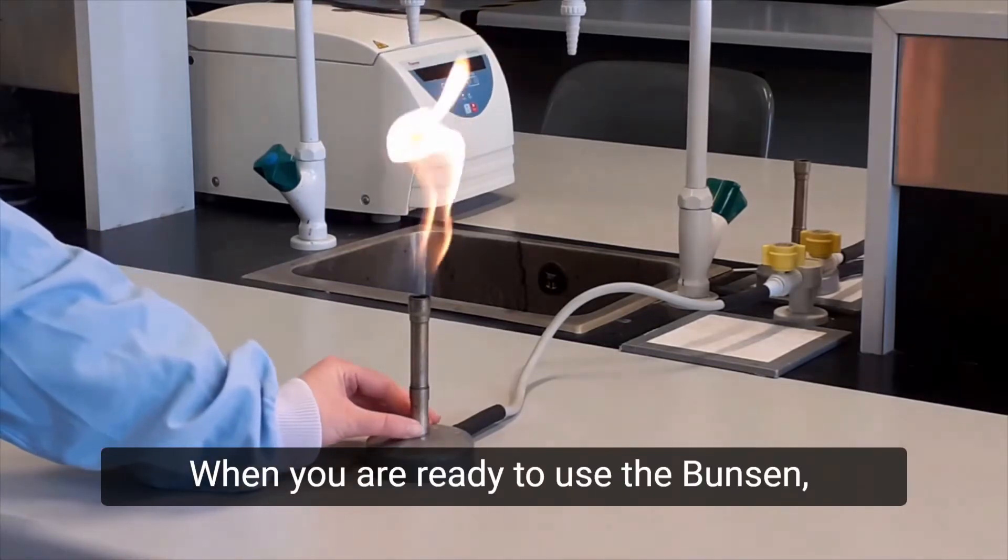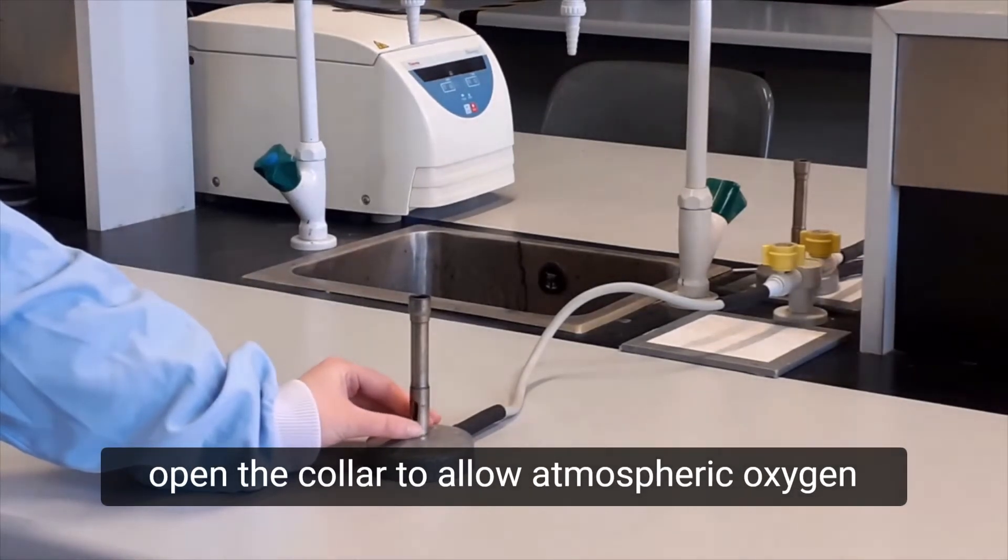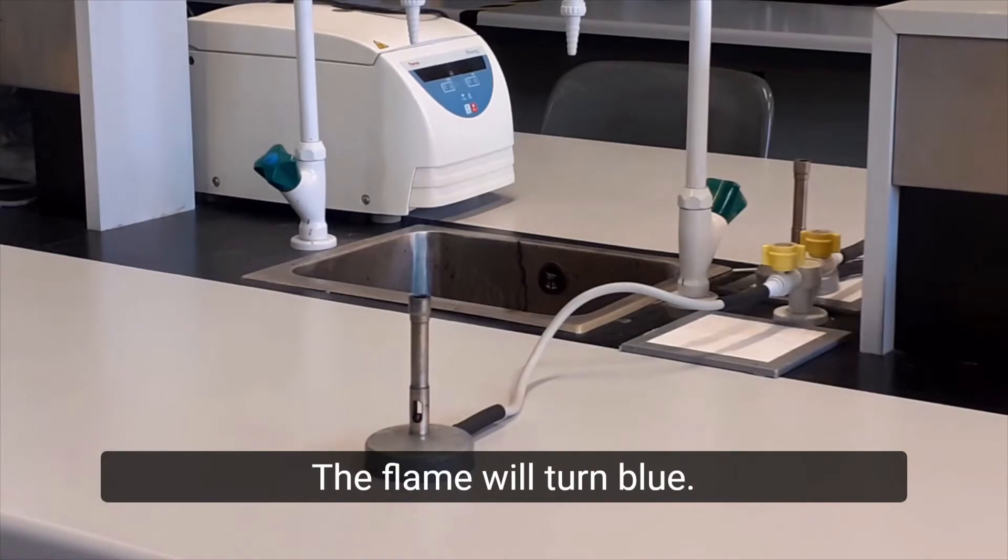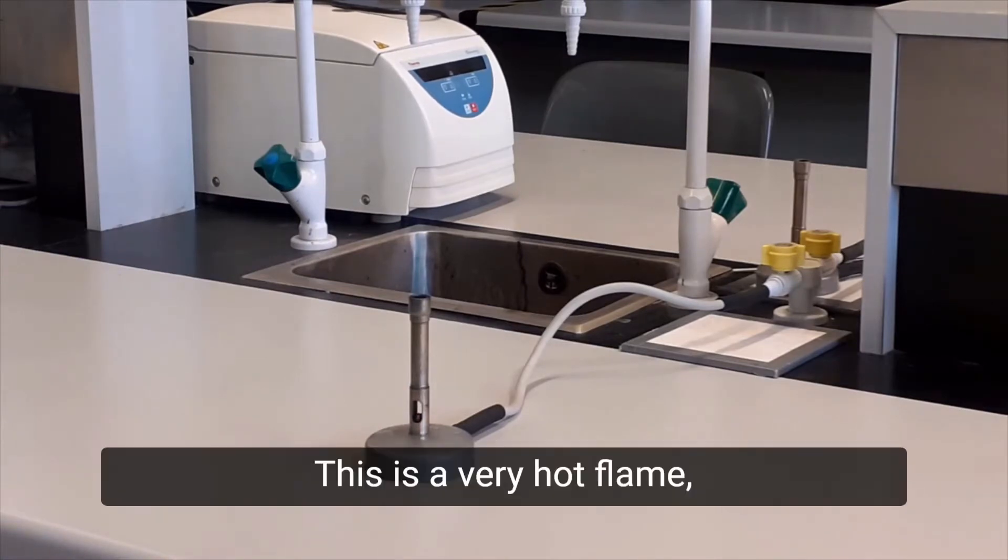When you are ready to use the Bunsen, open the collar to allow atmospheric oxygen to mix with the gas. The flame will turn blue. This is a very hot flame, but it is relatively difficult to see.